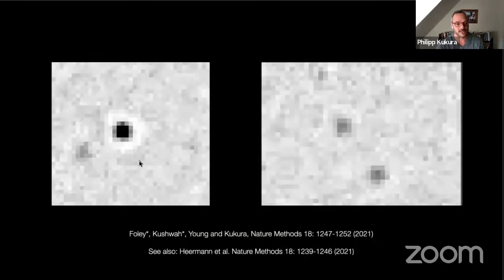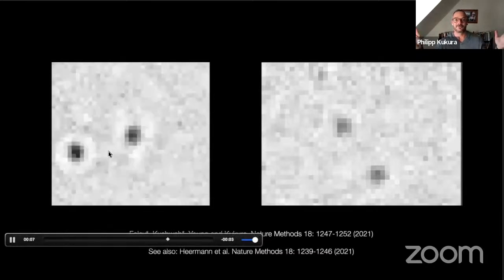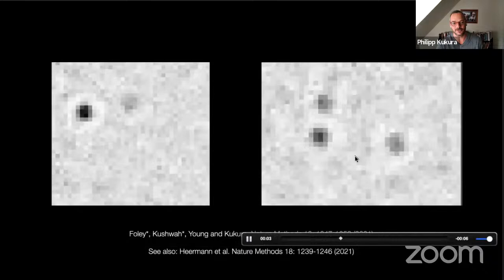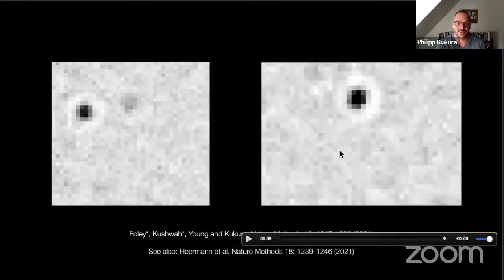And sometimes you could see the kind of things that we're ultimately after, where you may have a big object diffusing, and then after some time it turns into 2. So you have dissociation, and sometimes you would have 2 diffusing around, and eventually, you have association. Now, admittedly, this is still a membrane-associated protein, not a transmembrane protein or integral membrane protein. But nevertheless, in principle, this works. There's an assay challenge, but in principle, we are now in a position where we can look at association, dissociation, assembly in bilayers. You have a question?